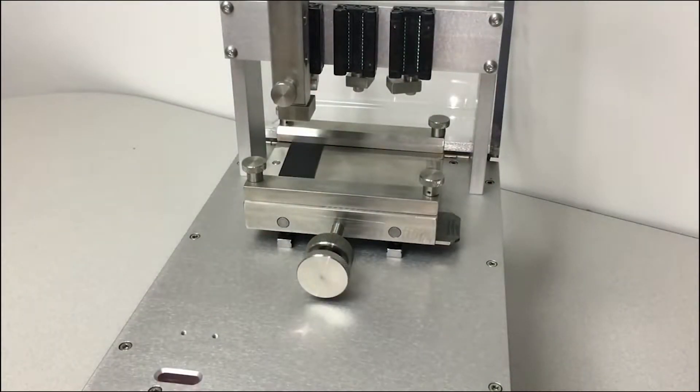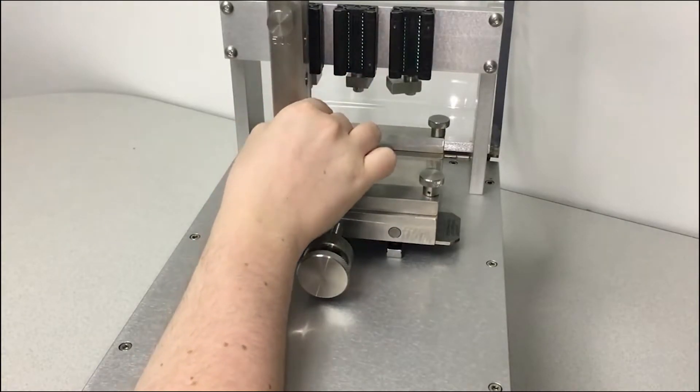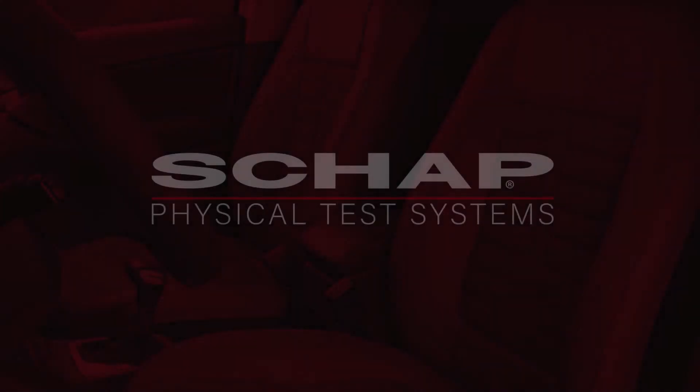And then it's all set up and adjust this to meet the correct stretch. And then get the safety off, put it down and you're ready to start your test.